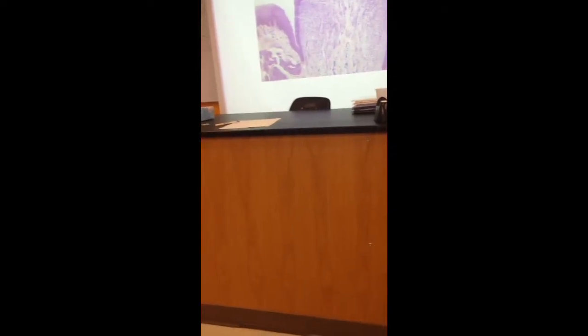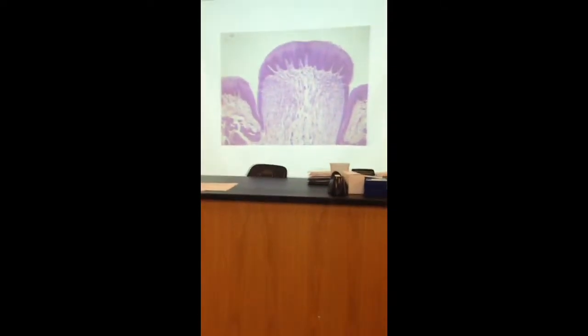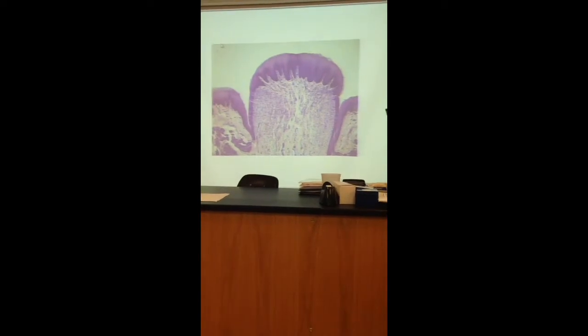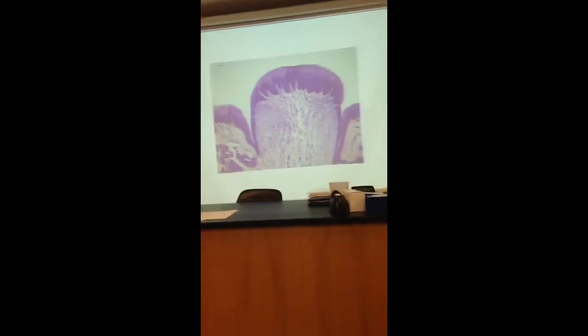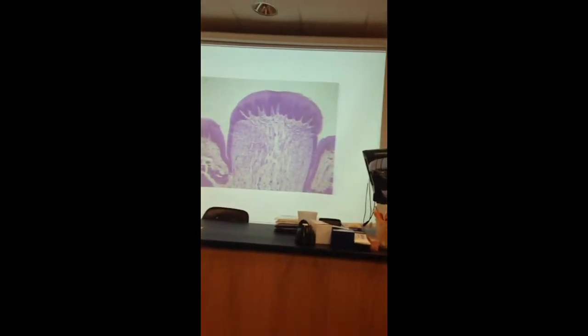Be microscopic images, and we're going to go over again what you need to know. You can follow along in your lab objective sheet. We're going to start here in the oral cavity, looking at a section through the tongue. And you're looking here at the tongue, extensions on the surface of the tongue.